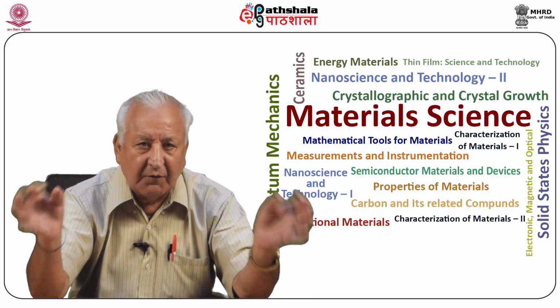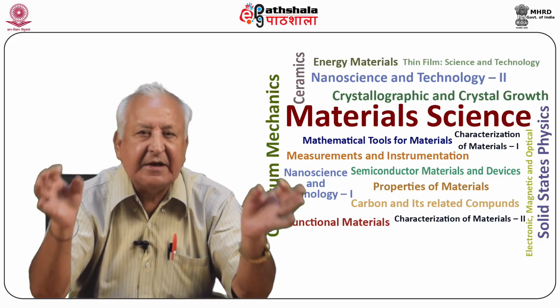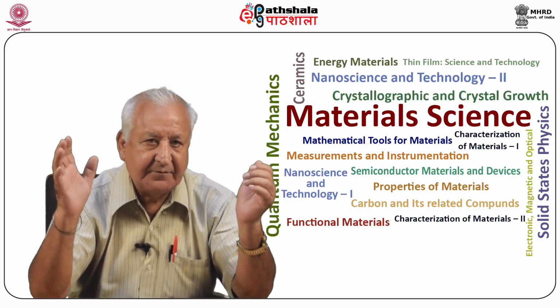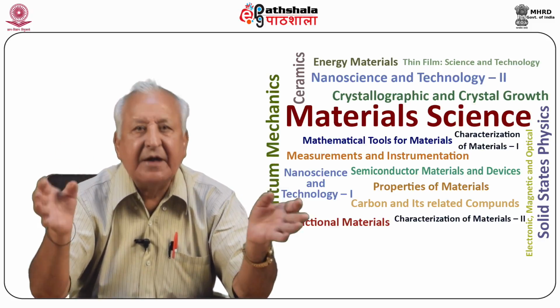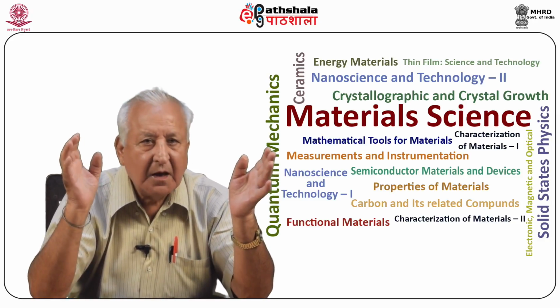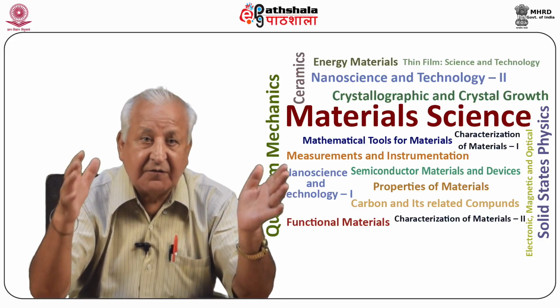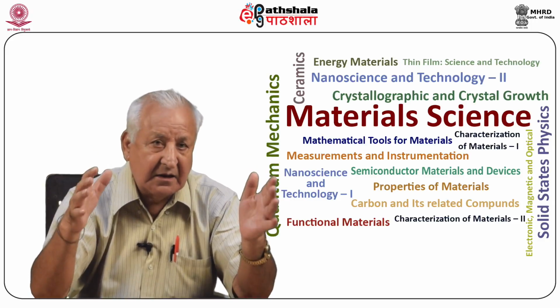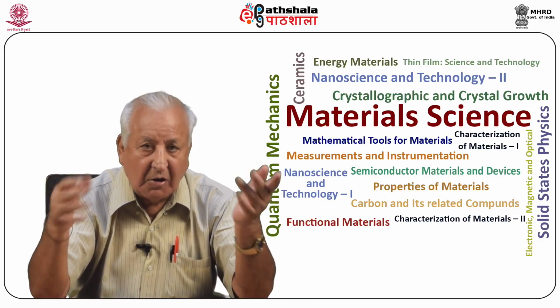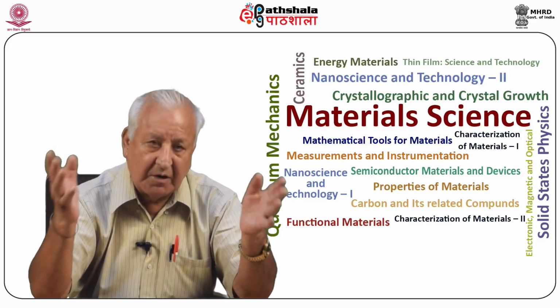The sample is obviously in a polycrystalline form, which is an aggregate of extremely tiny crystallites randomly oriented with respect to a given direction. As such, all possible orientations of all lattice planes are present in the powdered sample. There is bound to be a certain number of crystal grains which will be positioned with a given set of lattice planes making the correct angle with the incident beam for reflection to occur, while another fraction of the grains will have another set of planes in the correct position for reflection, and so on.